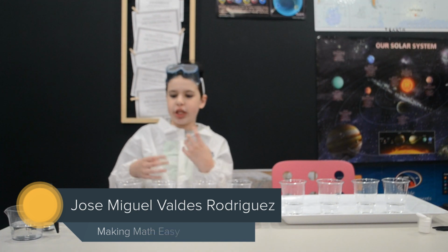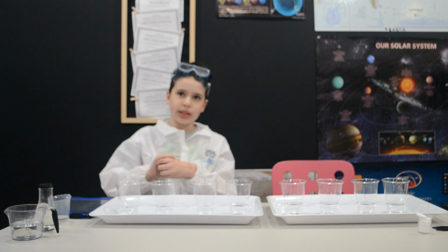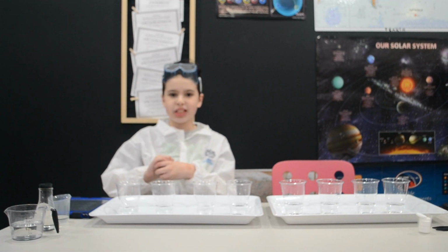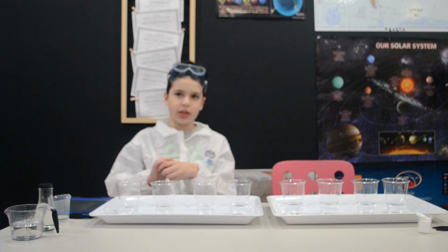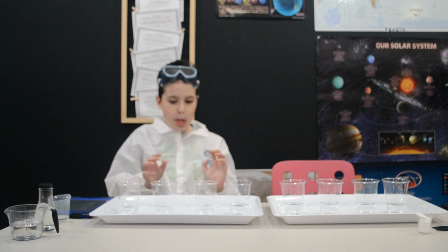What we'll be doing today is an experiment that will help us show how reaction rates change with concentration. And after, we'll talk about reaction rates, factors affecting reaction rates, and how to calculate it in this example. But to get started, we need to know what we need.